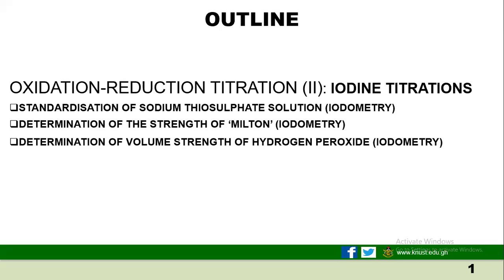All right, so week 7 is about oxidation reduction titration. We started that in week 6, and then we are doing the second part in week 7. Week 6 focused on using KMnO4, right? Now in week 7, we are doing iodine titrations, right?